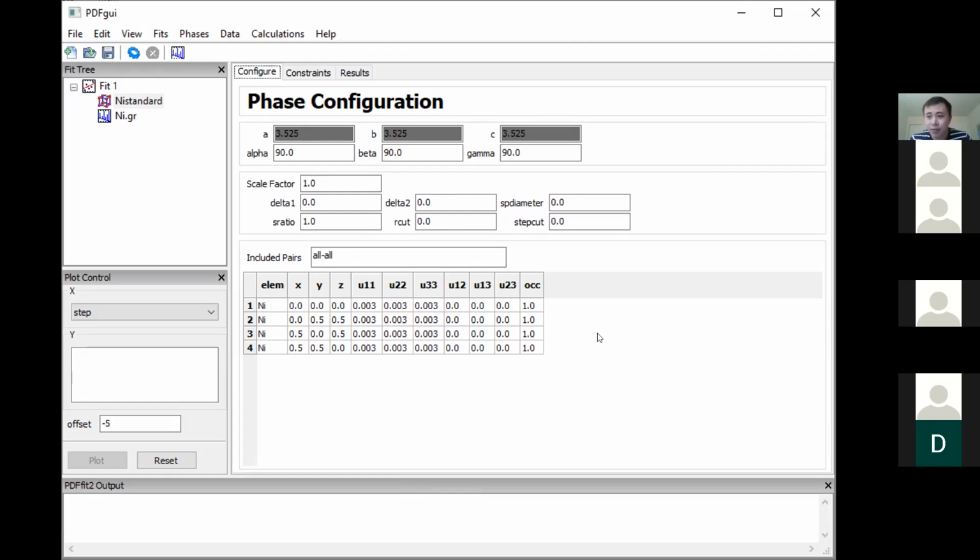That's actually the philosophy of fitting. When you want to calibrate the instrument, you always start with a simple structure. So you can use all the observations toward the advantage of the instrument rather than struggling with the structure of the material itself. So nickel is simple and is the preferred standard. Okay, so no atomic position needs to be refined. And as I said, we define them as isotropic, meaning that U11, U22, and U33 are the same, and we use just one number for them, right?